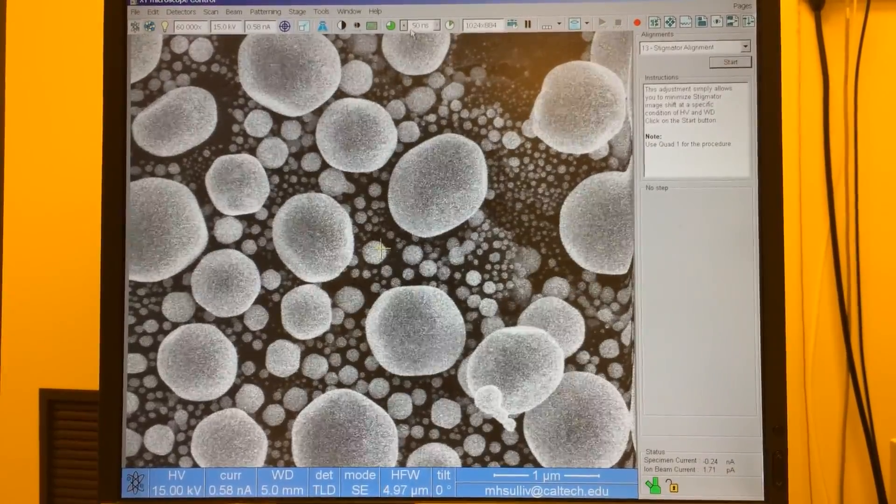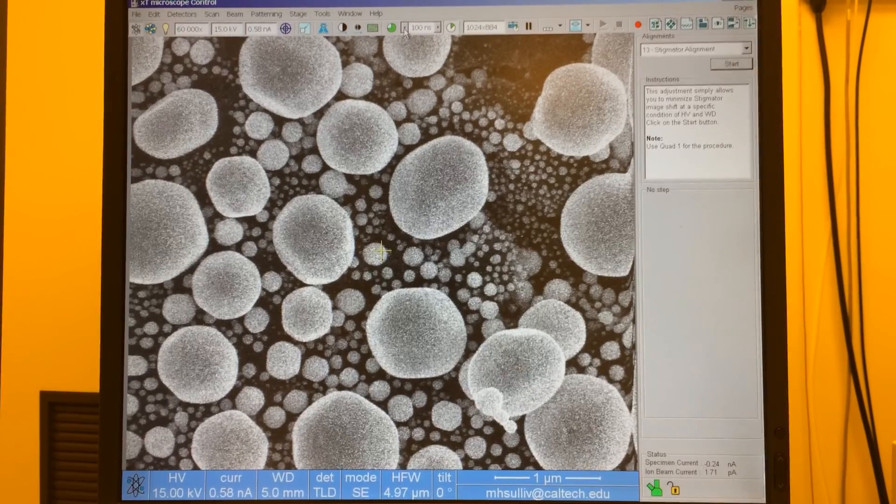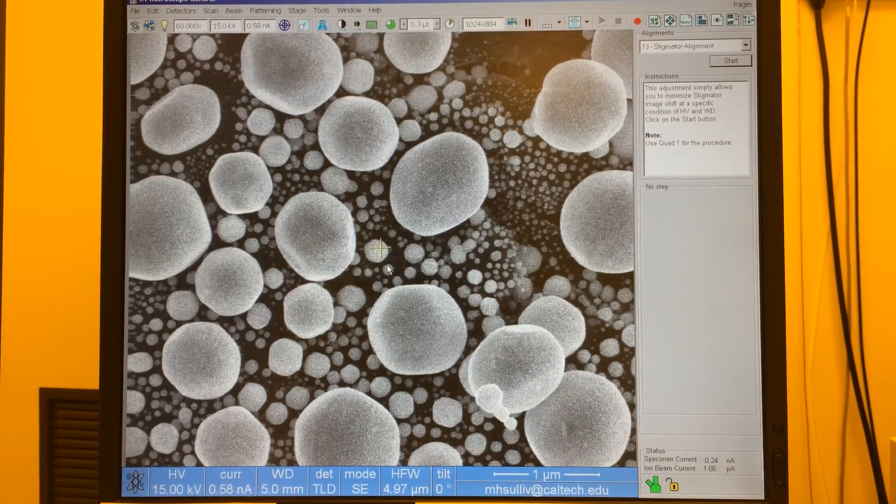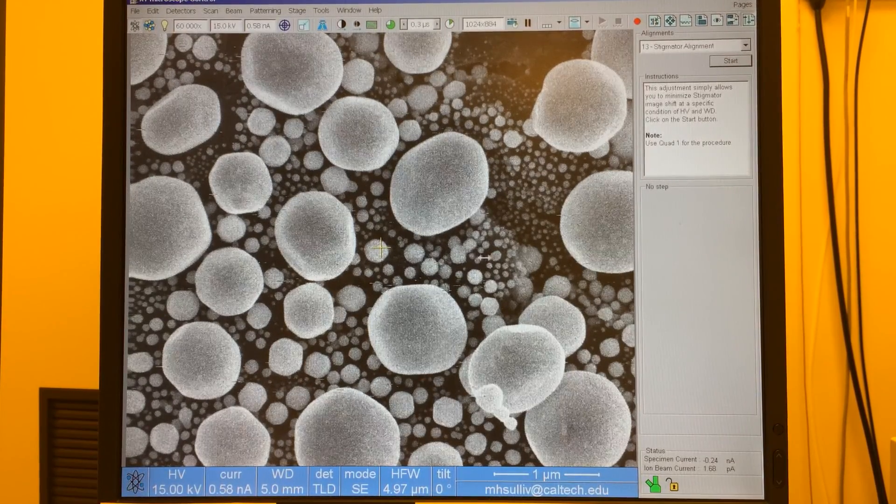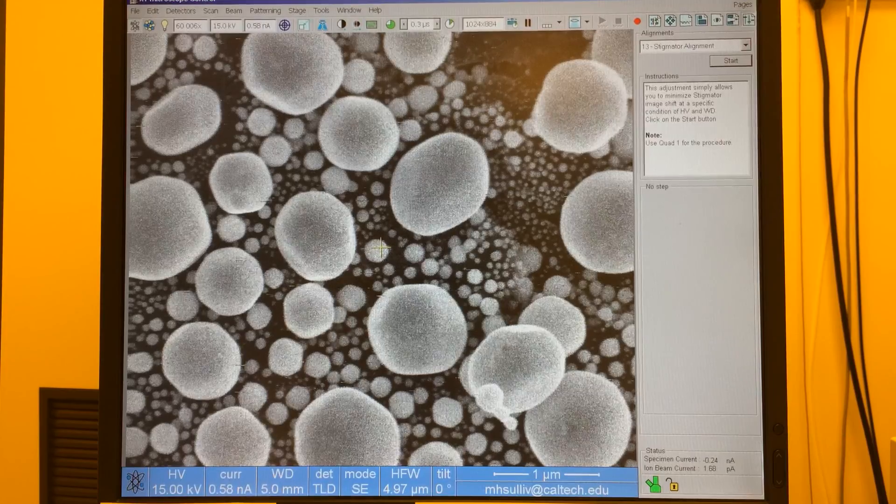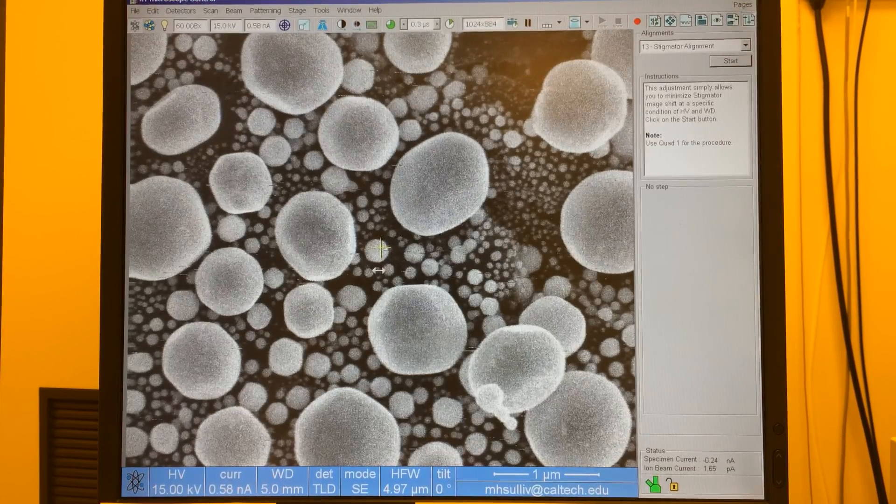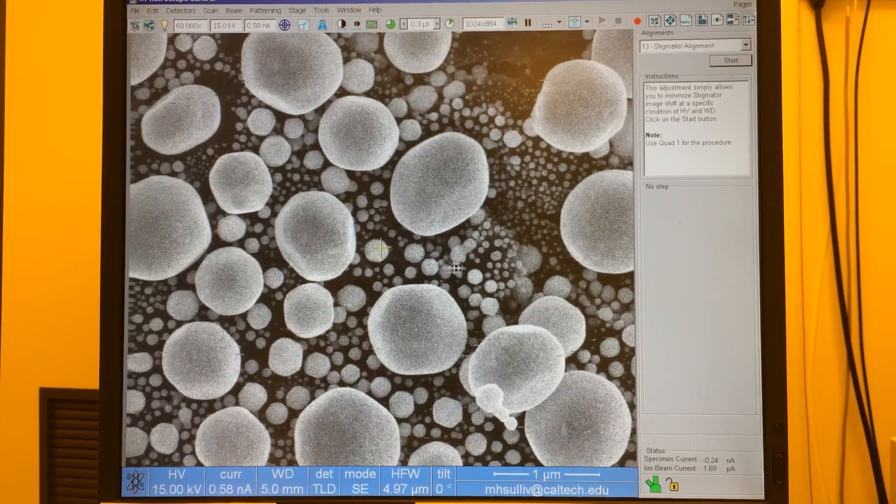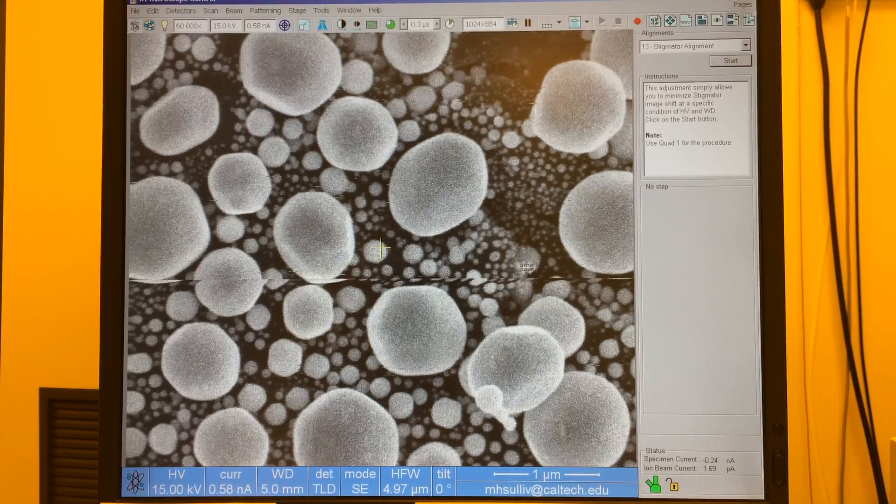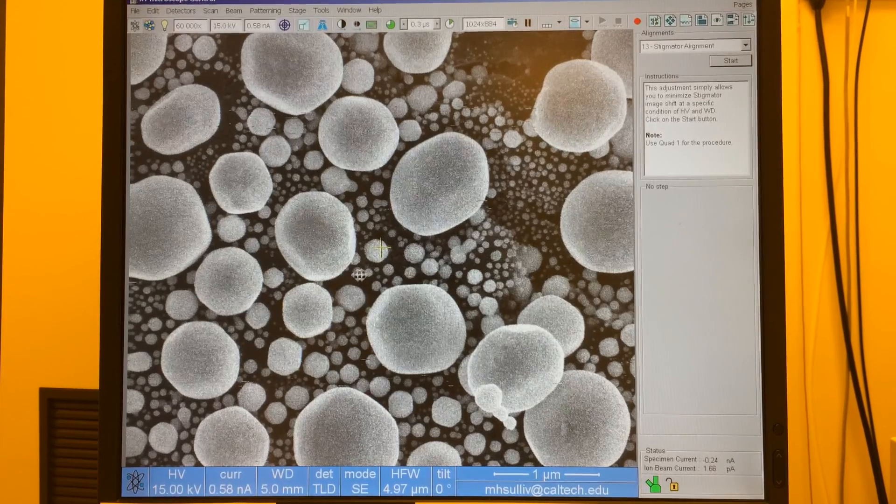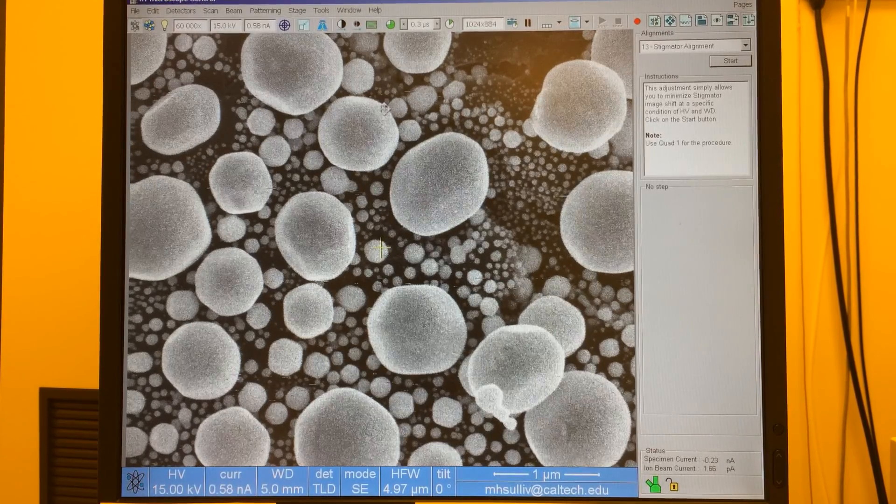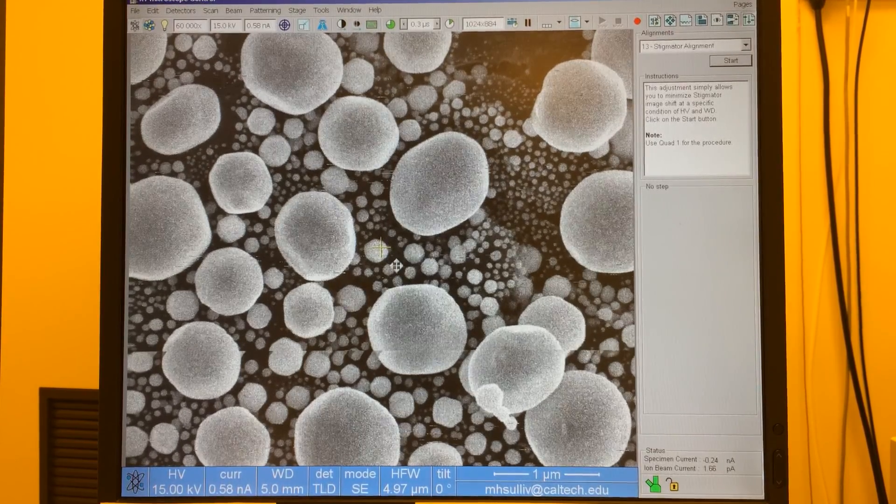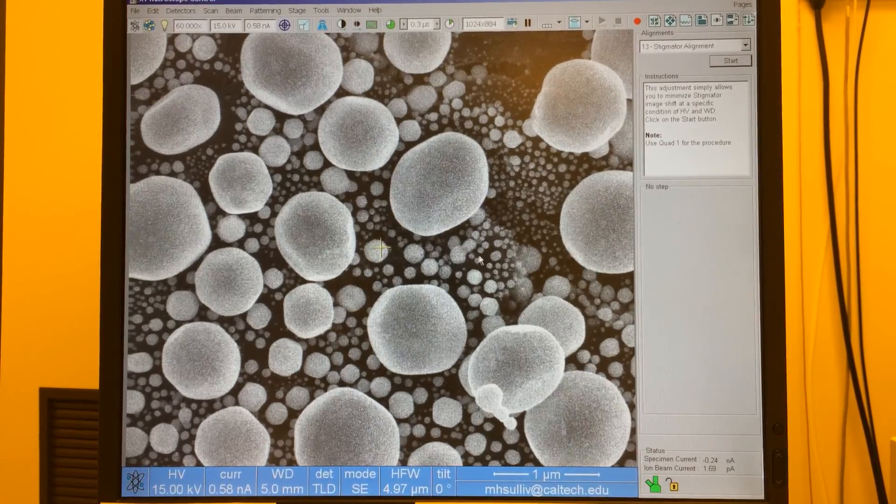And we want to check that we can again focus. We don't see any shifting. There's maybe a little stretching. As we fix astigmatism now with shift right click, we've minimized the overall motion of the image while we're doing that.